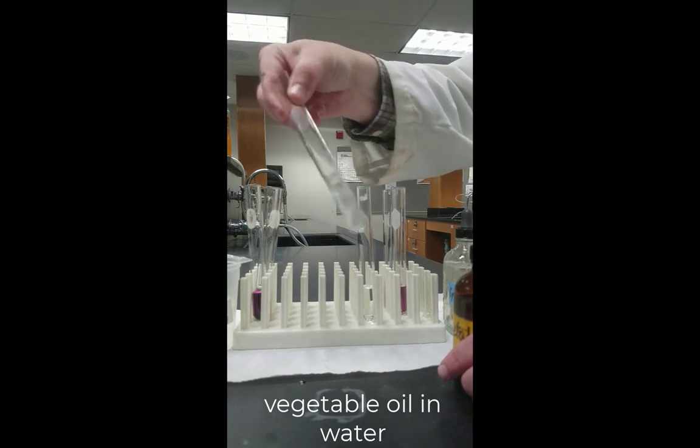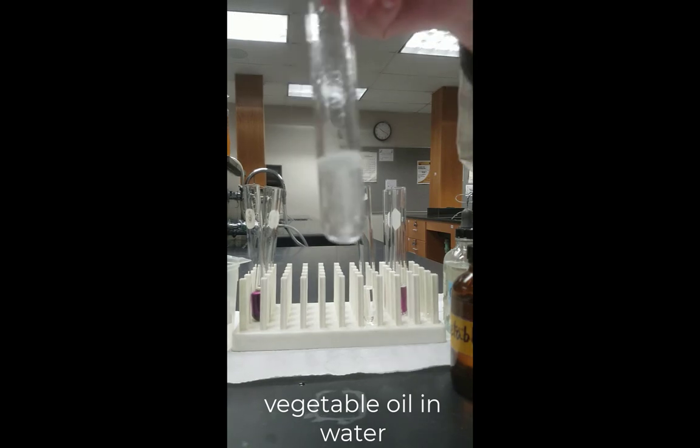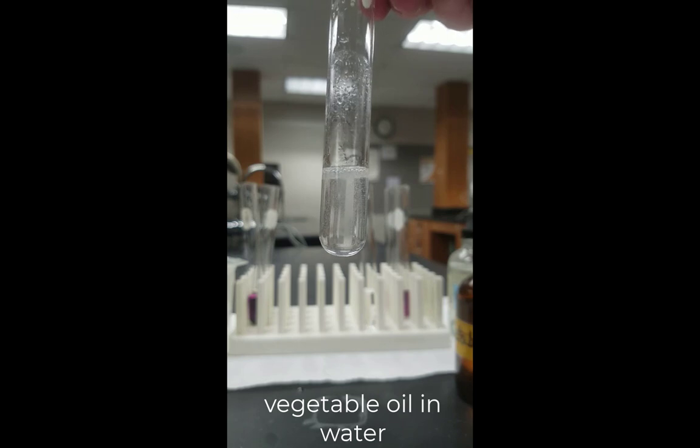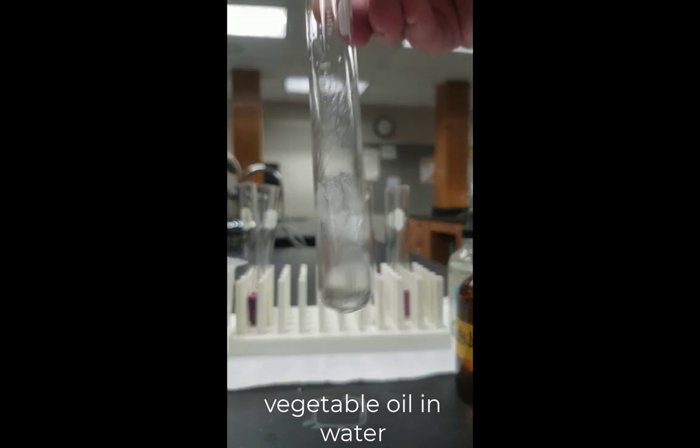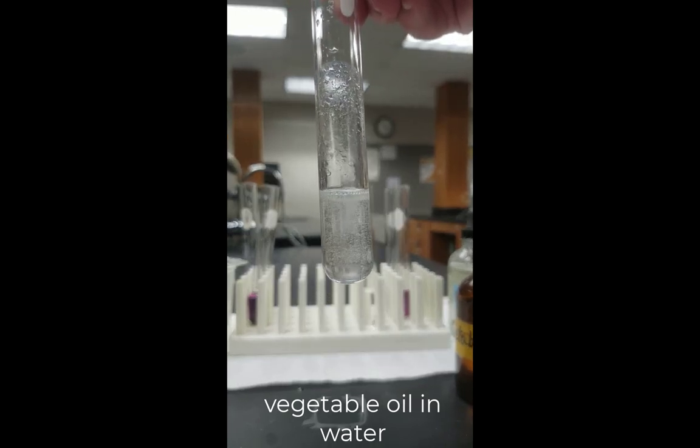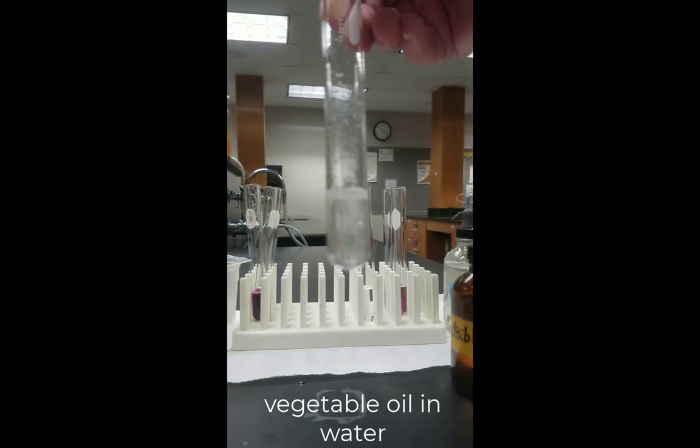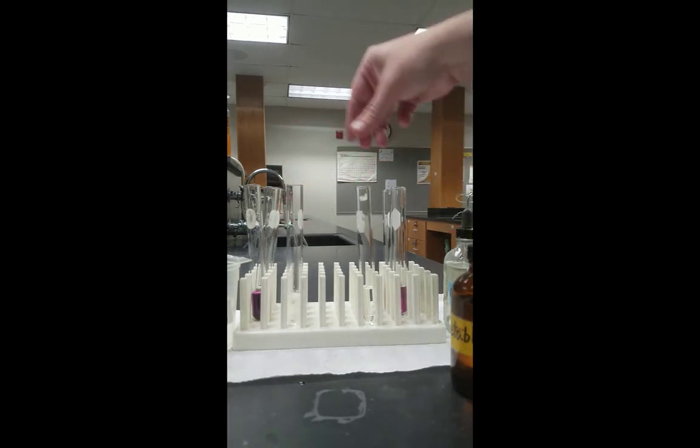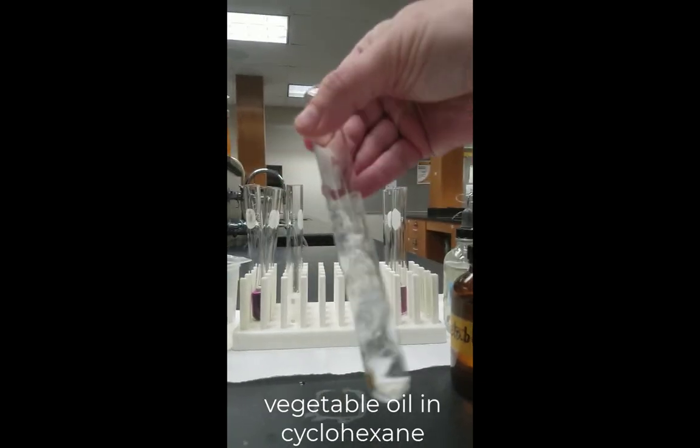So the vegetable oil in the water, you'll notice that there's lots of little bubbles. And that's the vegetable oil not mixing with the water, and it forms a layer on the top. When liquids don't mix, you will always get two different layers. The layer on the top will be the less dense of the liquid, and the layer on the bottom will be the more dense of the two liquids.